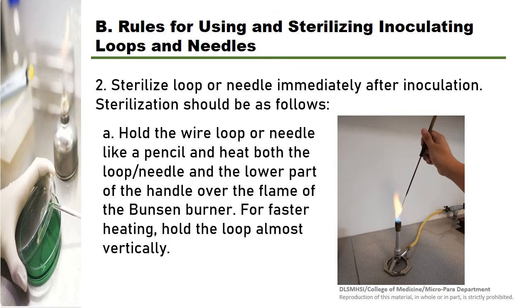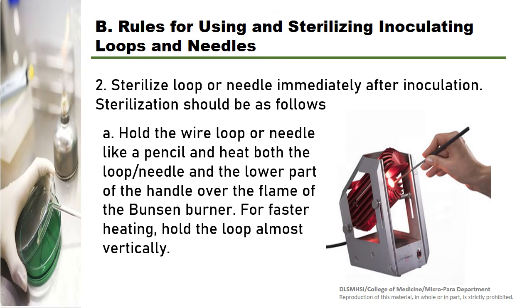Now, using a Bunsen burner is not always practical in all situations. The Bunsen burner or the use of open flames is not allowed when working under a biosafety cabinet because it causes disruption in the air curtain within your biosafety cabinet. As an alternative, other laboratories are using a microincinerator.